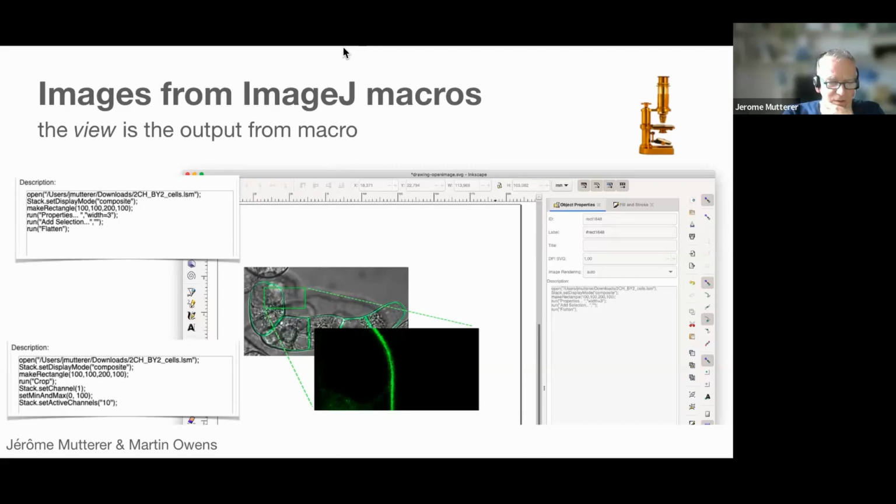There's someone in the chat. I'm making just a small pause to answer in the chat. What languages are supported? R, Java, MATLAB, no. So far, R, Python, and ImageJ macros, and PyMol and processing Java. So 5 languages.